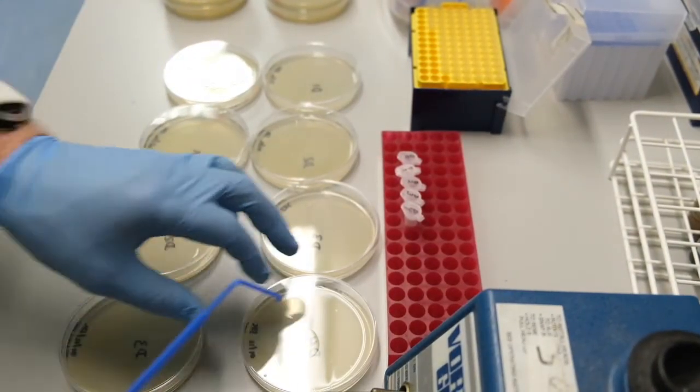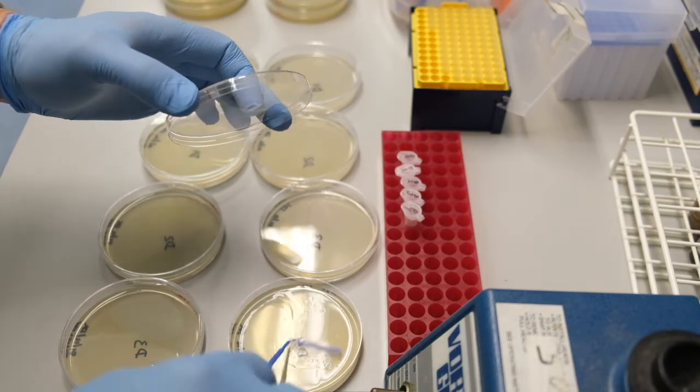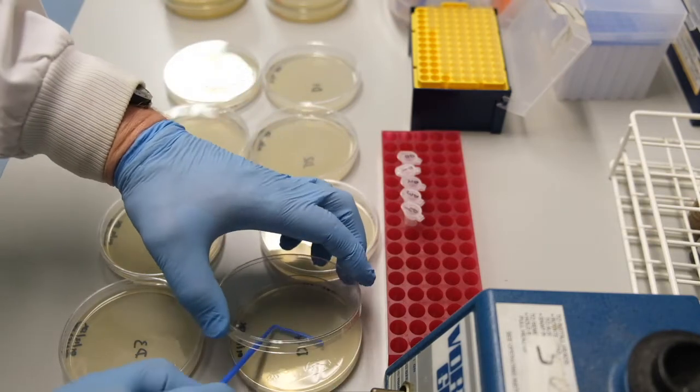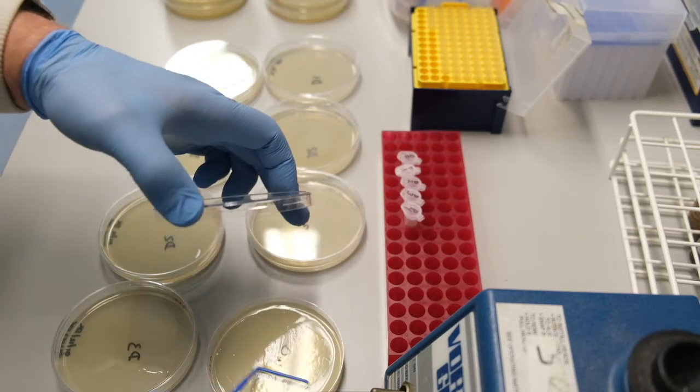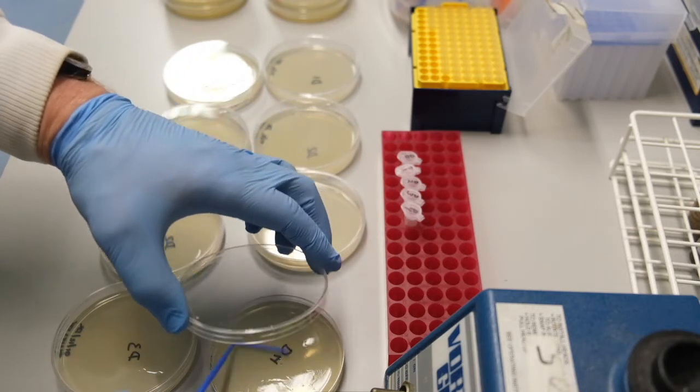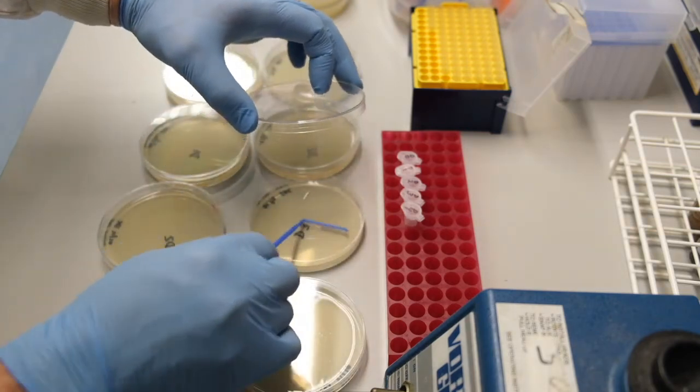We are now ready to spread the bacteria on our plate. We are going to use a sterile disposable spreader. Spread the cells, then turn the plate and spread them some more. Your aim is to spread the cells evenly across the entire plate.